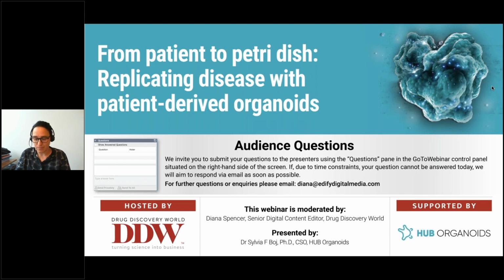Our next question: I'm trying to make patient-derived breast cancer organoids. I'm using the standard protocol, which is generally used in literature. However, we get fewer cells after the dissociation step. Can you help me to improve, and how can I get more cells?